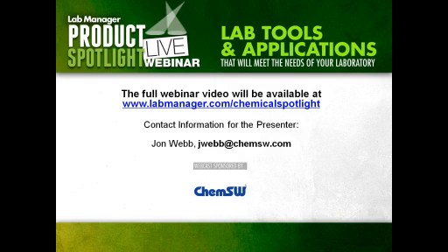But if you don't, then it's just as simple as using a keyboard wedge scanner, logging into the actual system, and disposing those containers. Most researchers, if they have a small collection of containers that are already used up, will wait to the end of the day and actually scan all of those materials out. But the key is having a simple system and leveraging that barcode technology. It just turns into a few simple scans for them to comply.